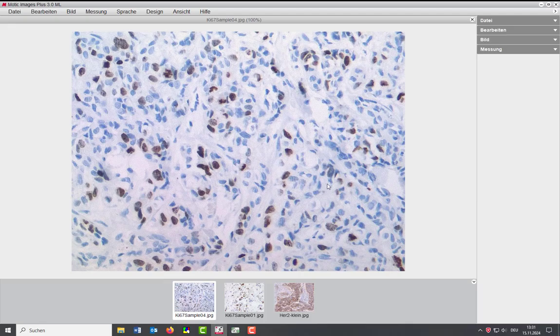That's this one. It's a bit of a mock-up, to be honest, because I don't have a microscope camera on my computer here, so it just shows snapshots of microscope images. However, the software works like a screenshot, so it can really directly analyze images from any live view of your microscope camera. So let's imagine that would be the live view of your microscope camera.